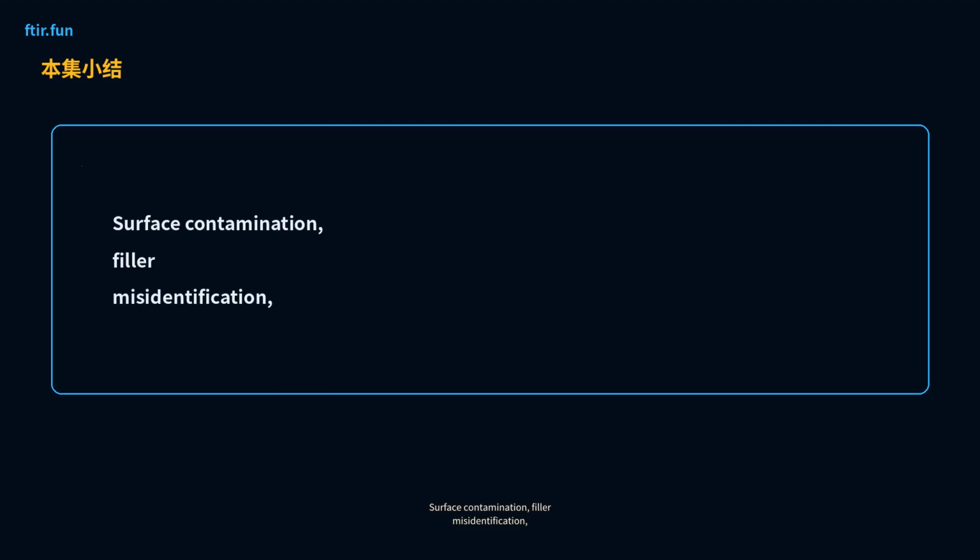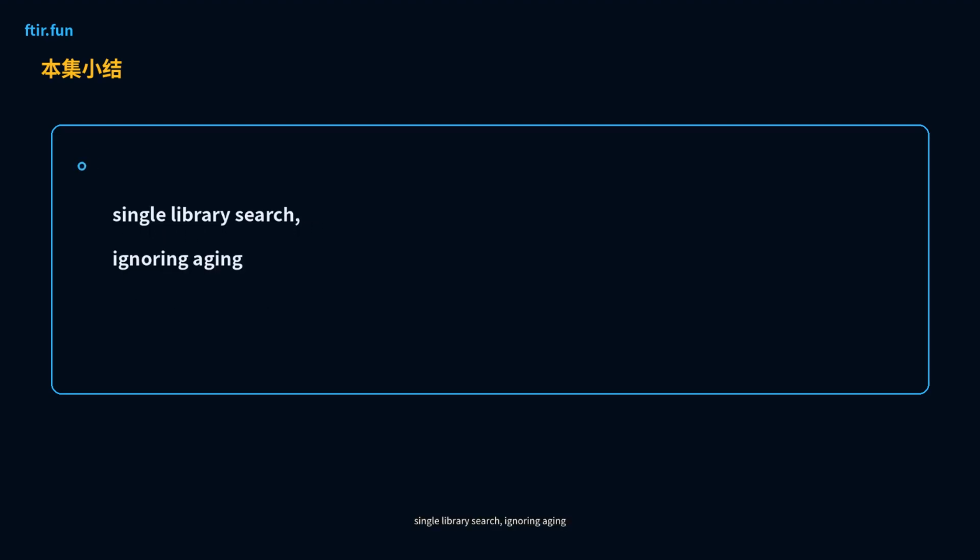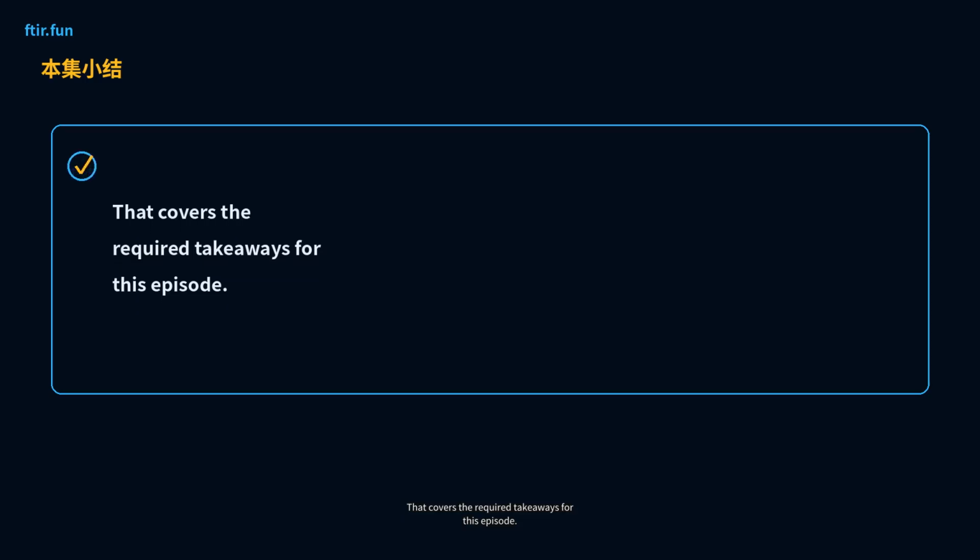Common pitfalls: surface contamination, filler misidentification, single library search, ignoring aging. That covers the required content for this episode.